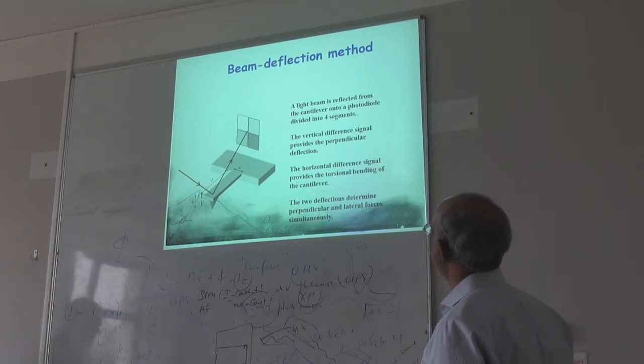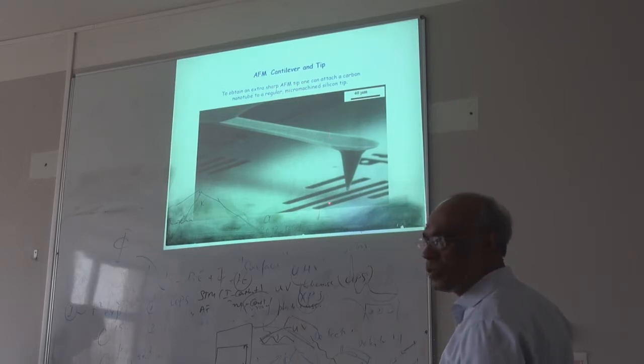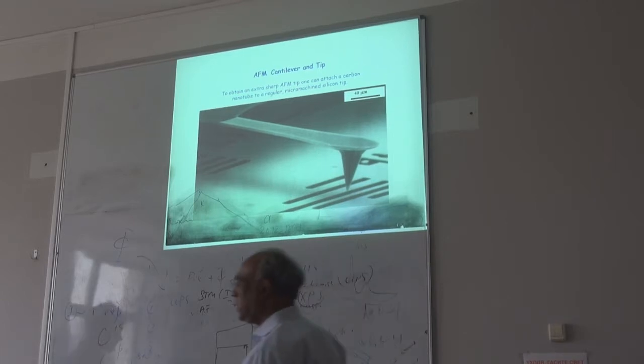So this is how this deflection is measured. Here is a standard AFM tip. Nowadays, one of my former students and her husband started a new company.